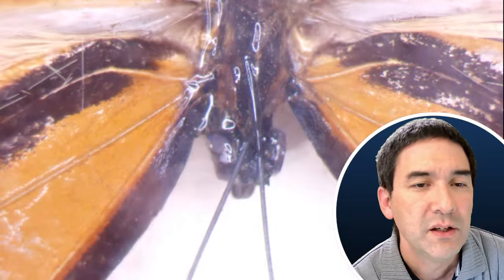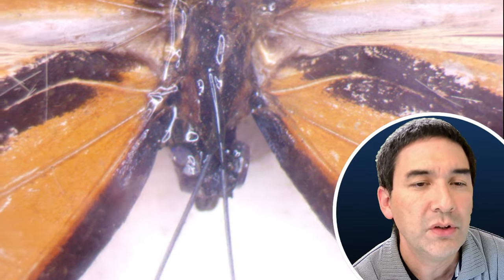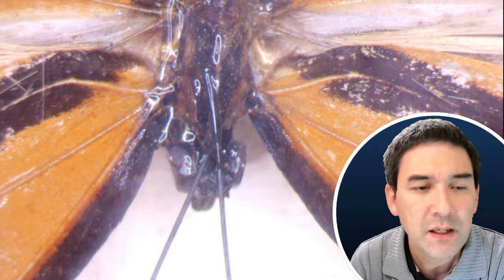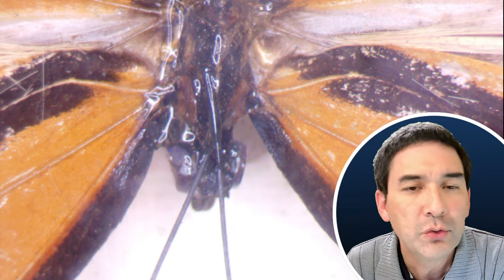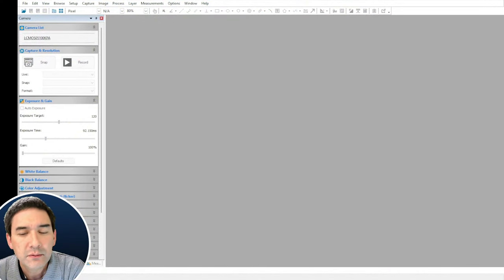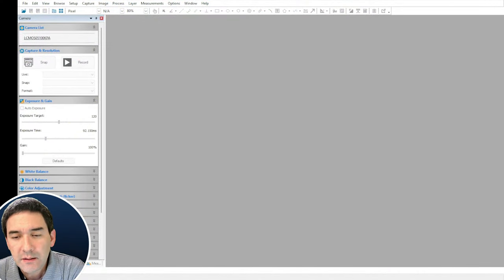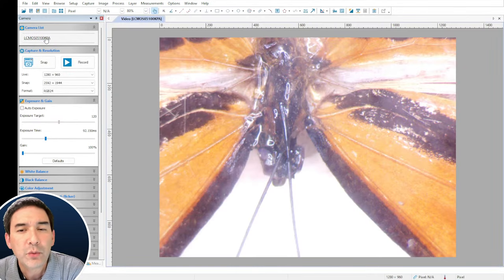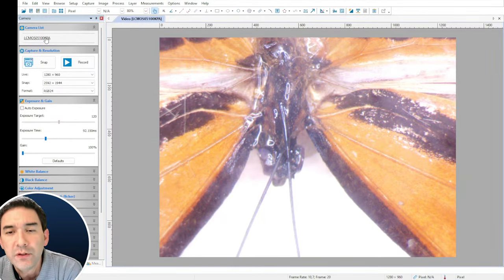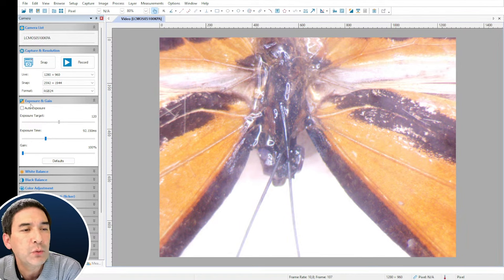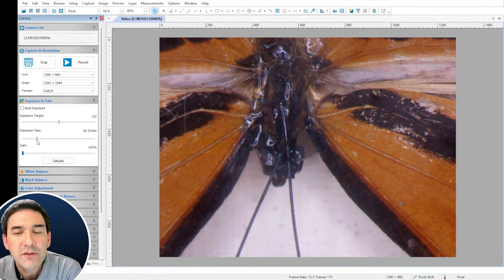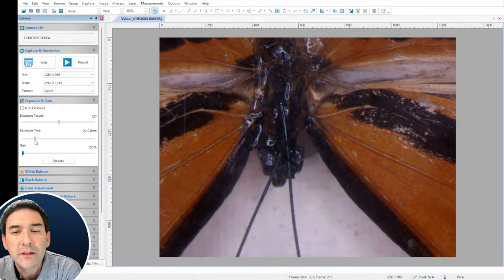I'm going to switch programs to TubeView to take pictures. I'll turn on the camera — so that's basically now the view. I'm going to adjust the exposure and lower the exposure time a little bit. You see the contrast goes up — it's much better this way. As I zoom in further, the image becomes darker, so I have to increase the exposure time again.